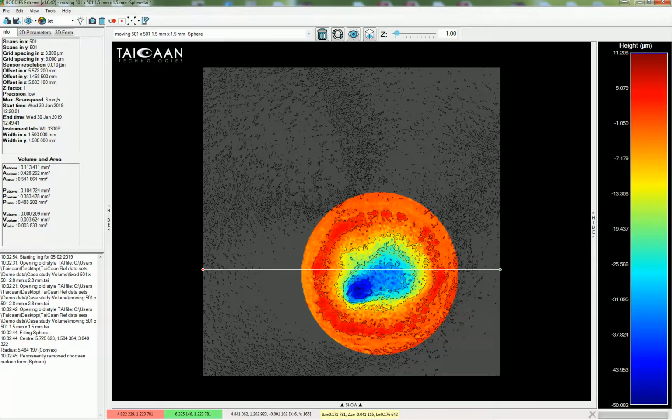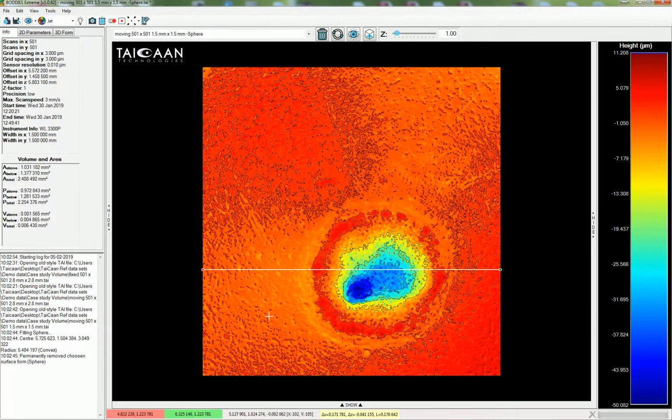Now, just to finish this exercise off, let's replace all of the data. So we're going to include all again, and here it is. Just remember the values that we had. I'm just going to change the circle here. Let's have the circle highlighted.